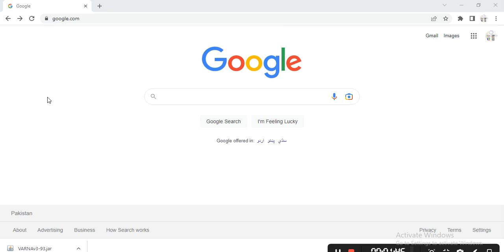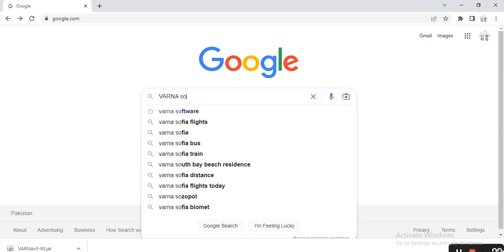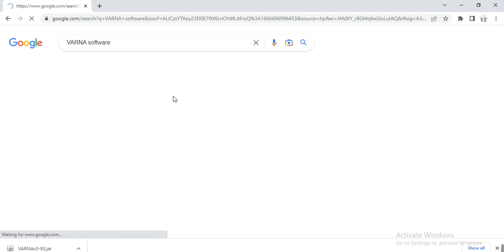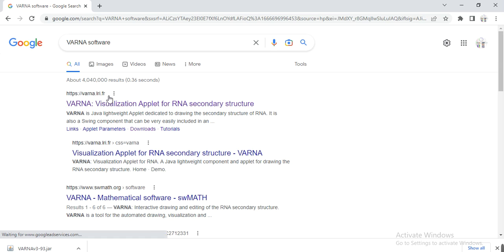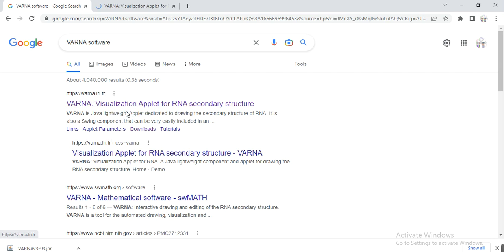Open Google search engine or any search engine, write VARNA software, and here is its website: varna.lri.fr. Open it.